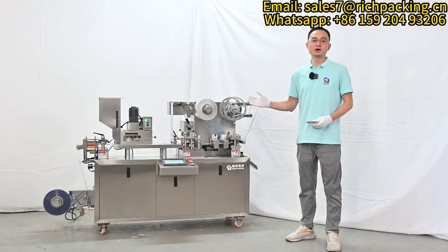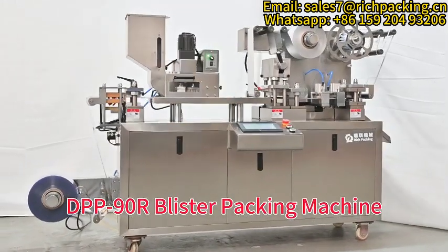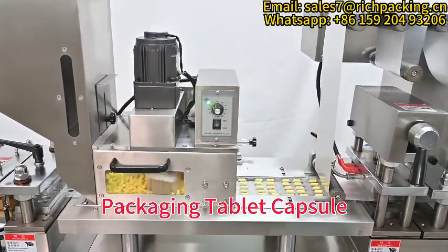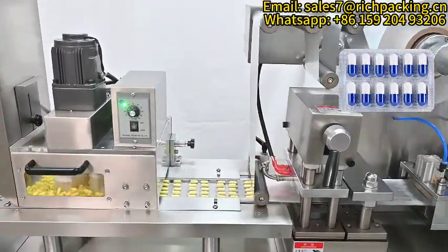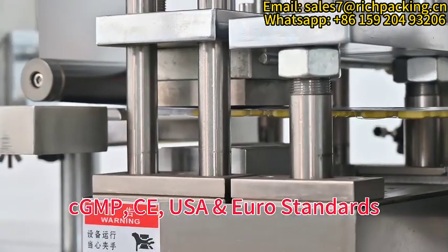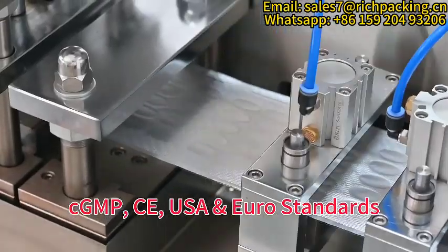This is our blister packing machine, DBB90R new design model, for packing tablets and capsules into aluminum PVC or aluminum-aluminum packaging. It fully meets CGMP, CE, USA and European Union standards.